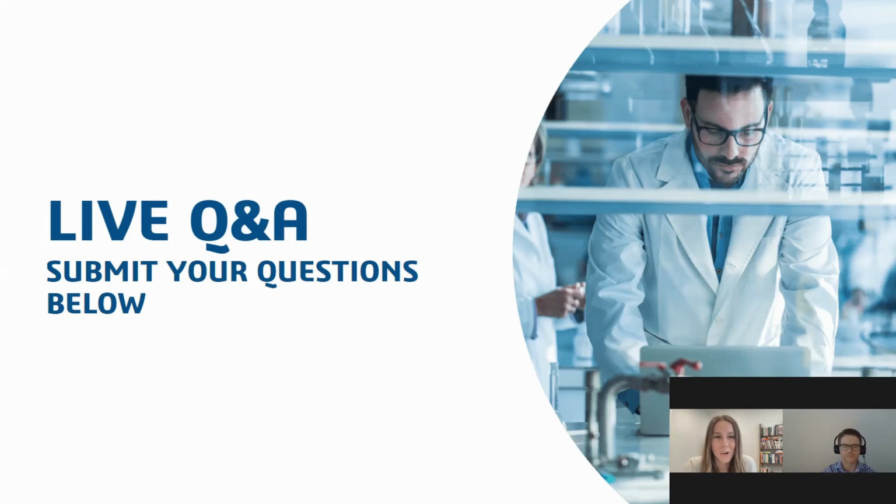Thank you. And we'll end with this one here. Someone is asking, do you have an API for LIMS integration in general, or do you work with shared data views or files? Yeah, so I know we do have APIs in place for the LIMS in OneLab. And so I know that we can integrate with different systems that way. That's one of the access points for it. Technical implementation of the APIs is not my strong suit, but I know that it's something that we support, and our tech sales people are more than capable of working with different integrations as necessary.